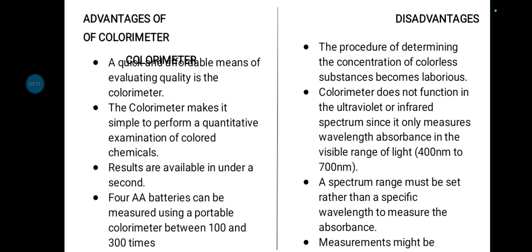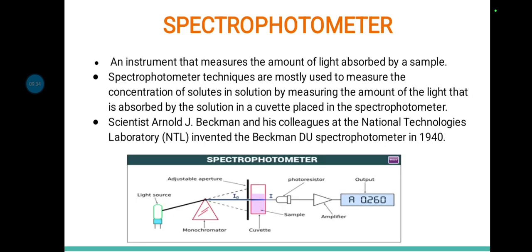Then next, a spectrum range must be set rather than a specific wavelength to measure the absorbance. We have to set a spectrum range. We cannot set a specific wavelength. The measurements might be, if the thing is not clear, I'm really sorry.